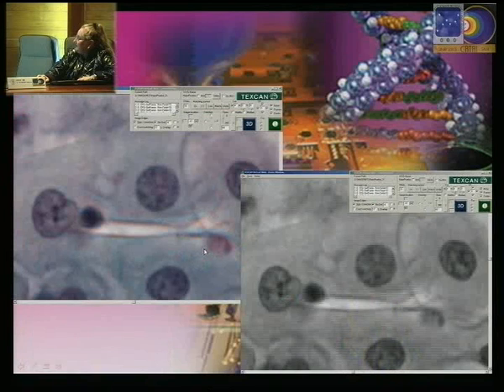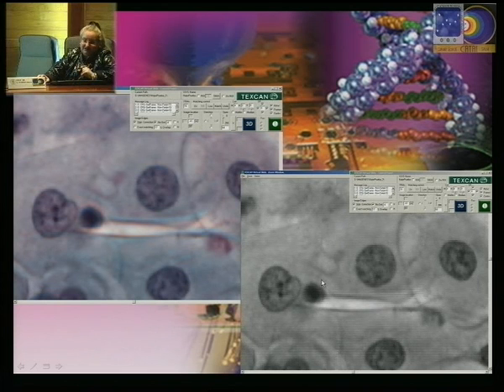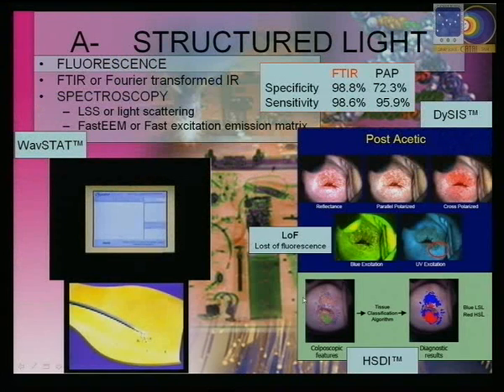But these are not very common cameras in the average use in the laboratory. As you can see here, the detail is better seen in the black and white image than in the color image. The reason is that the color image is a combination of the four pixels around, and therefore you lose some of the details, and this decreases the contrast that we have been talking about.